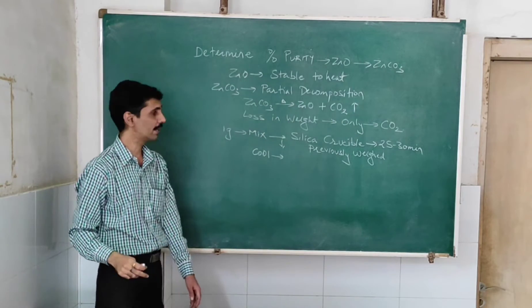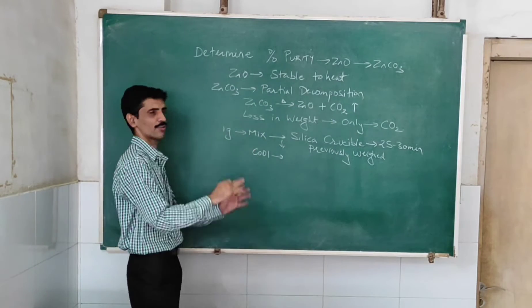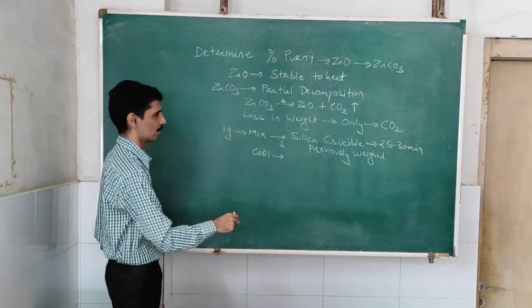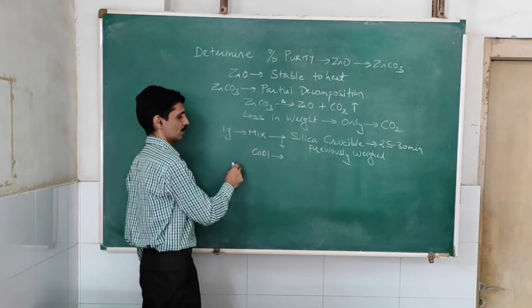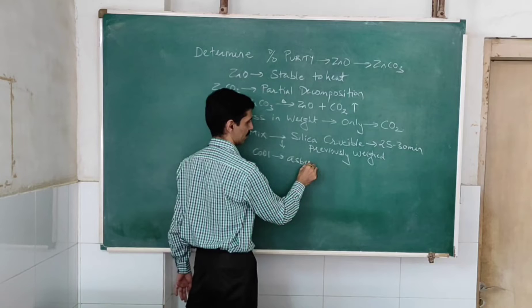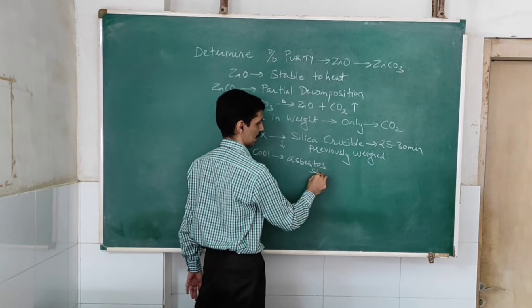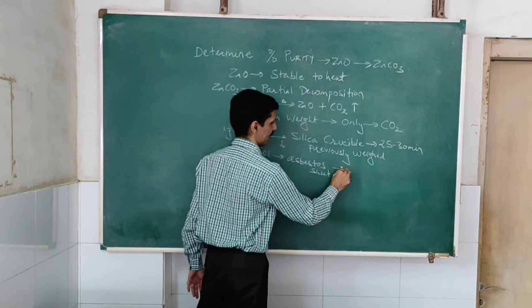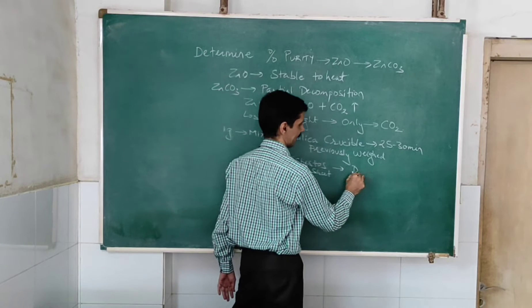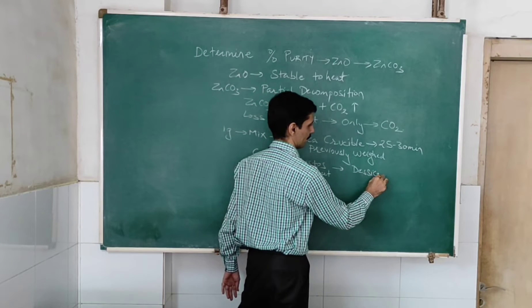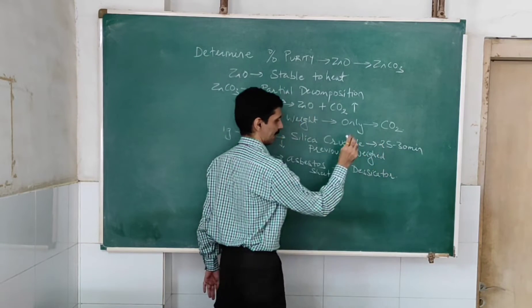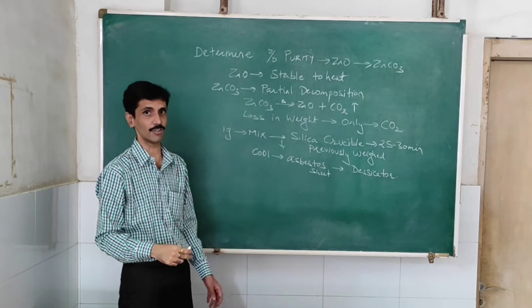Now, once the heating is done, once we are very sure that the carbon dioxide is removed for this duration, we need to cool it first of all in asbestos sheet, and then we are going to make use of a desiccator.